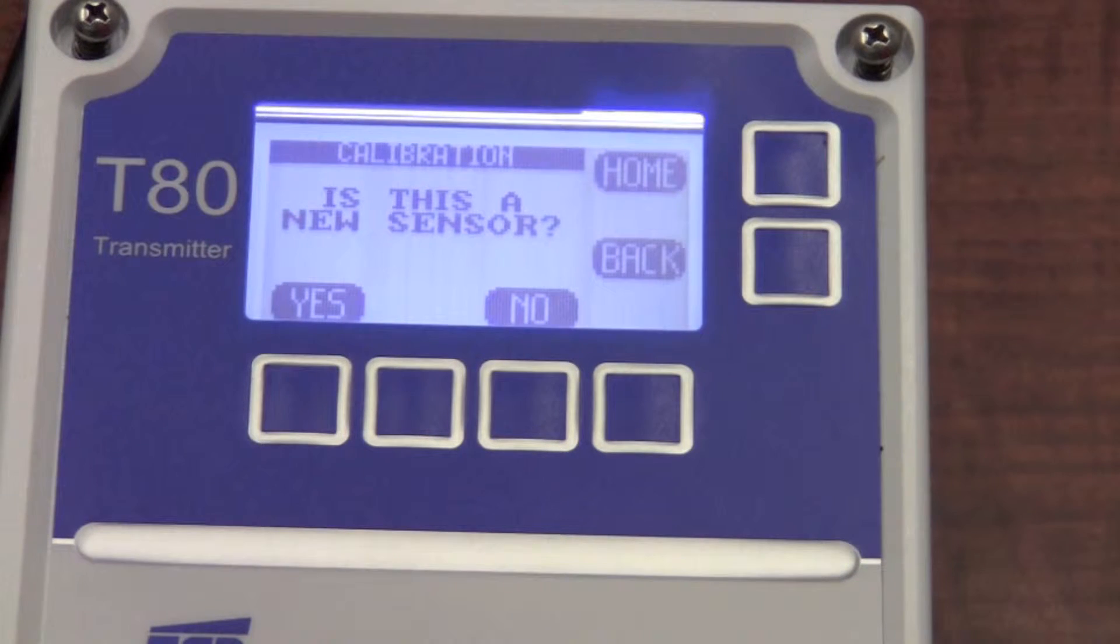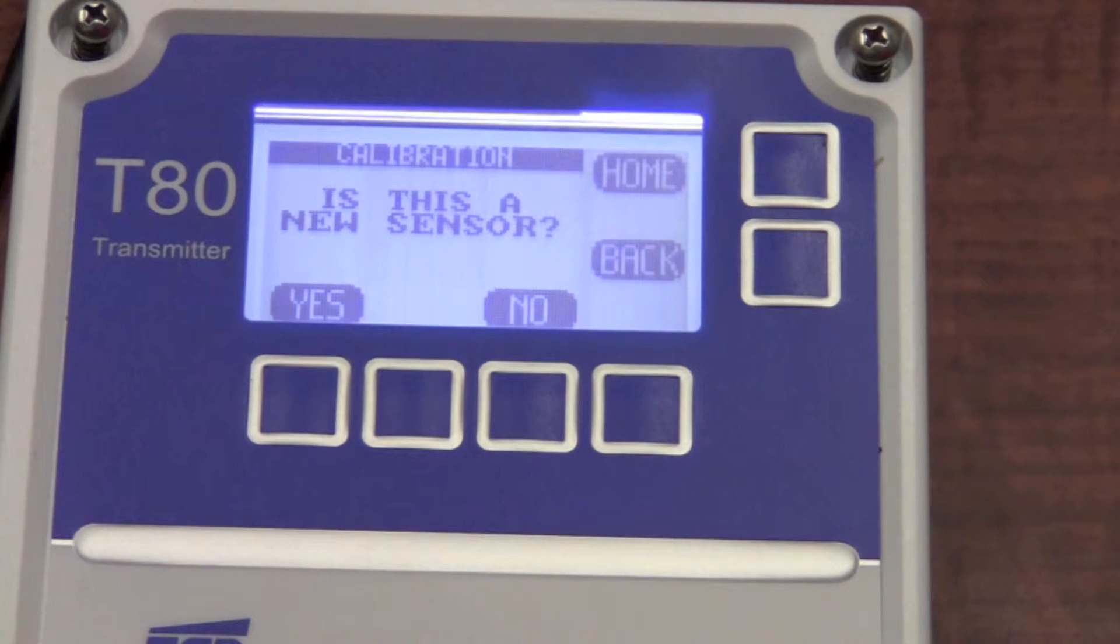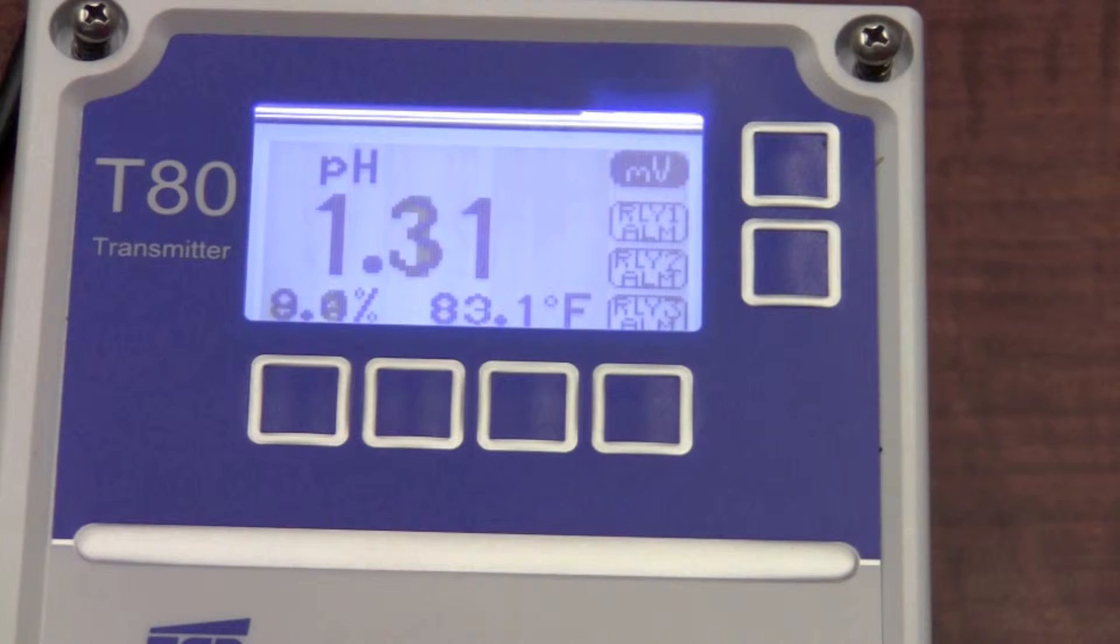The reason it asks this is because the S80 stores three calibrations. If you happen to find out that you had a bad buffer solution or something along those lines, you could always revert to one of the prior calibrations. In our particular case, this probe is not brand new, so I'm going to answer no. If I answer yes, it wipes out all three calibrations and would accept the one that I'm going to perform as the one and only.